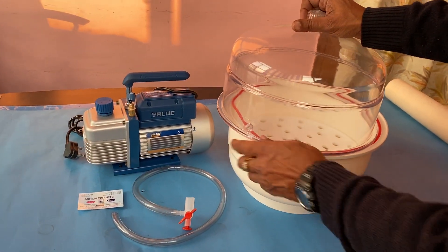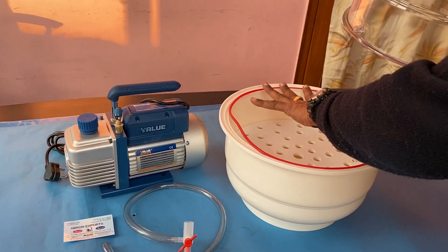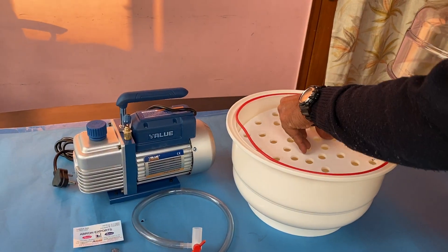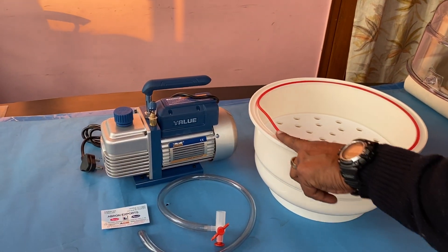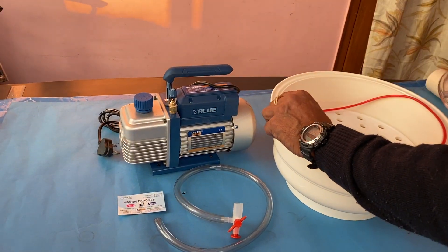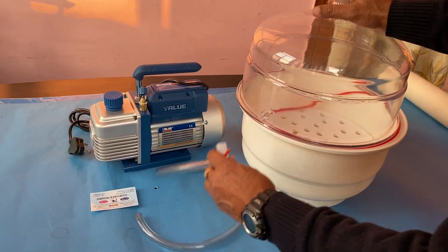This is the vacuum pump and vacuum desiccator, about 12 inches, which has one plate inside. Silicon grease is to be put here so that it works properly. Then you have to put this gasket on properly.